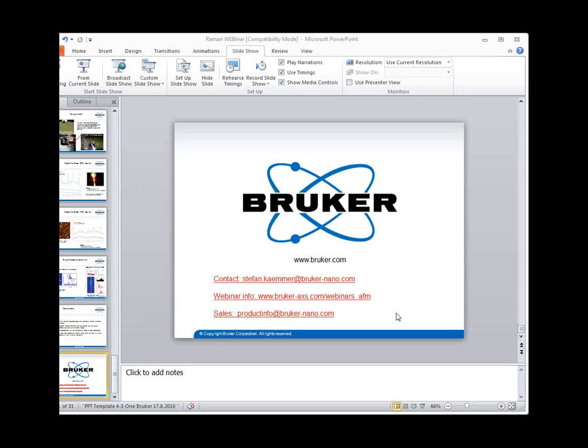When you do optical measurements where you rely on an optical beam being focused on a tip, one thing you don't want to do is scan your tip. So TERS measurements you basically can't do with an Icon instrument without significant modification, because you're scanning the tip. You would focus your laser beam on the tip, and the moment you start your AFM scan, you would move that tip through the beam. So you wouldn't get a TERS signal. In the Innova, you focus your laser beam on the tip, and then you scan the sample. So your tip constantly stays in the focus, and you have the enhancement. So different things here.